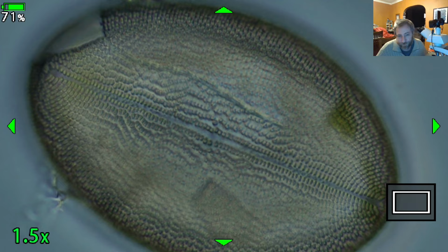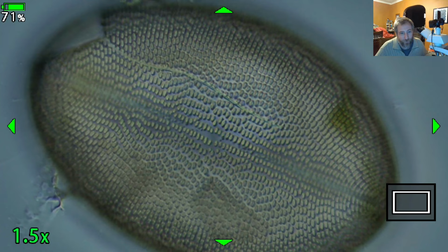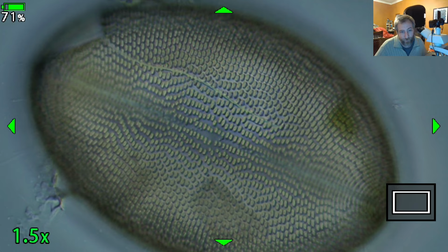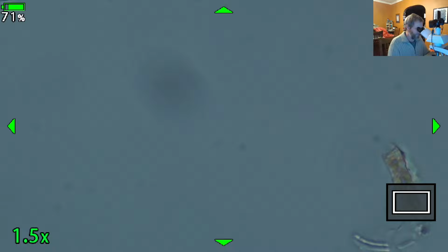My real camera is at the top of this thing now, and that's a nice 4K view if I want, that I can run through it. And I can take some really nice 50 megapixel images of some of these diatoms. It's a ridiculously high powered camera relative to what we had on there before, which was a 5 megapixel camera.